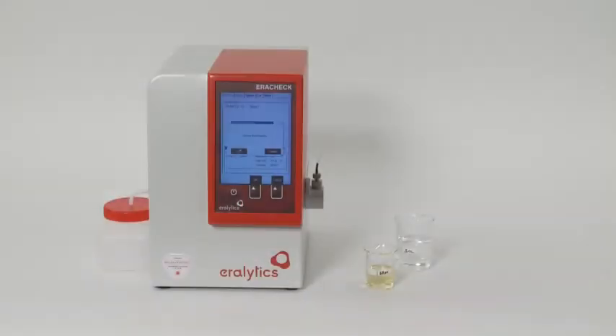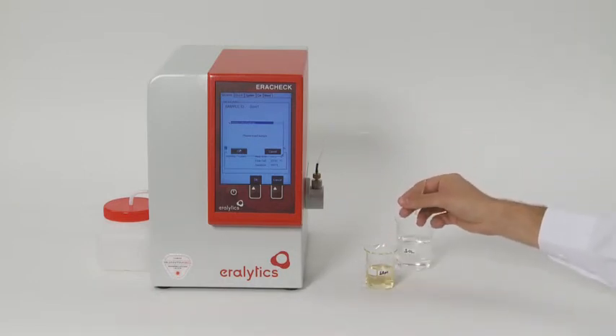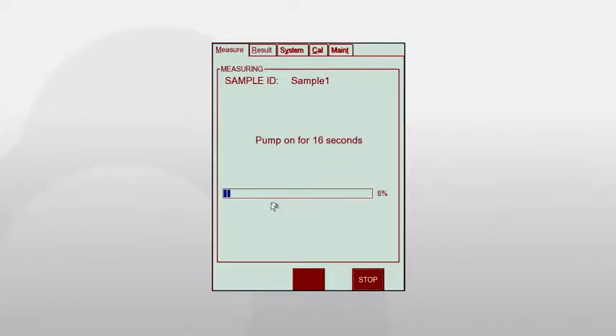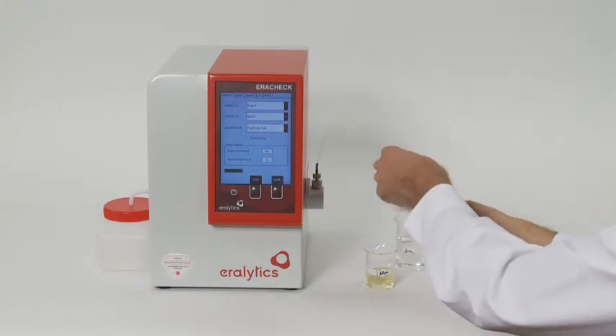After the measurement of the solvent, wipe the filling tube with a tissue, put it into the extracted sample, and confirm this on the display. The analysis is finished within two minutes. The displayed result is the concentration of oil and grease in water, measured in milligrams per litre.